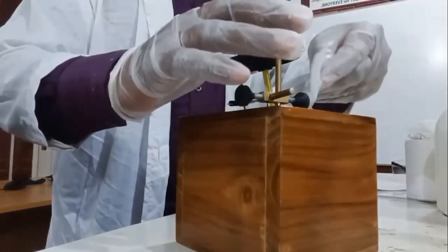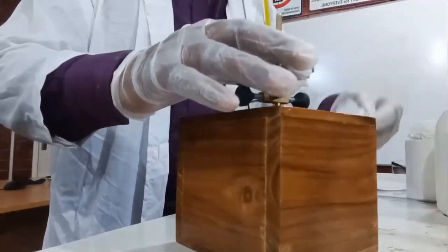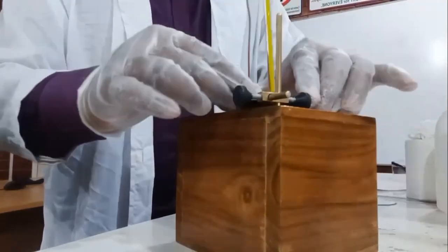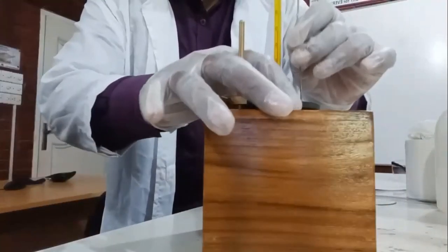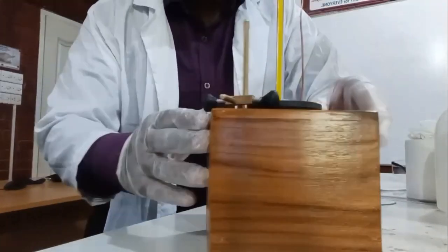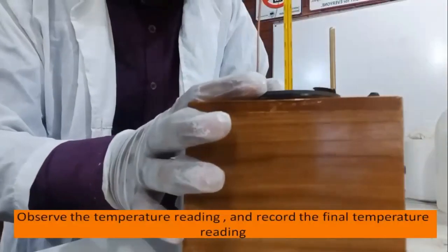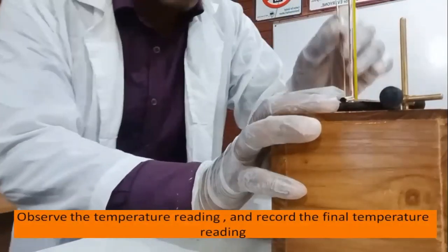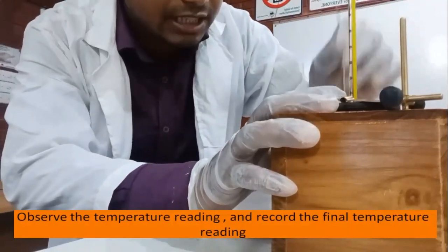Now I am adding 5 grams of sodium hydroxide in the calorimeter. Now I will stir the solution with the stirrer. Now I am seeing that temperature is increasing continuously. Our initial was 30 degrees Celsius. Now temperature is almost 45. That means temperature is increasing.